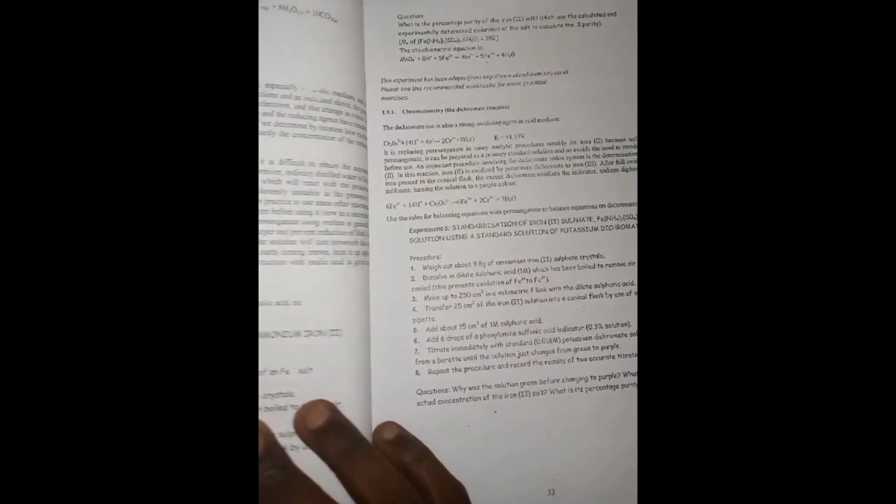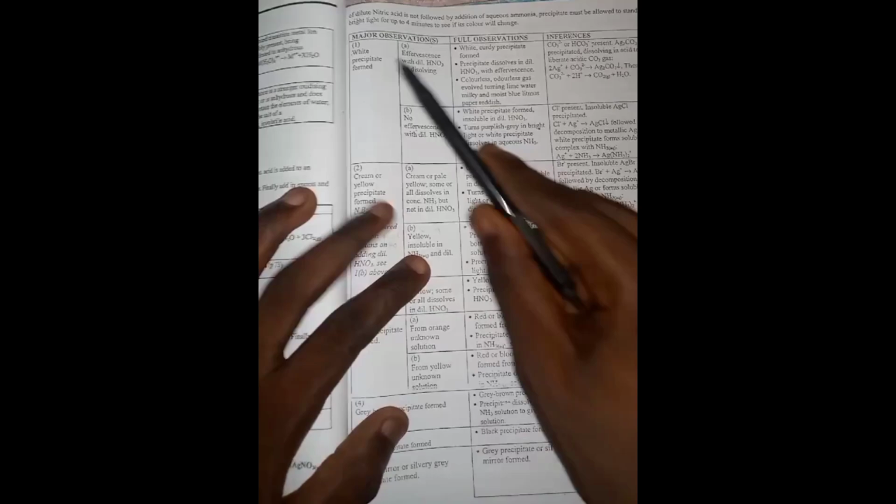So we'll simply open our page 78. Opening that. So friends, as you can see, this is it. I have it here. This is aqueous silver nitrate with or without dilute nitric acid, ammonia, and so on. So this is the table to which we are now going to refer.